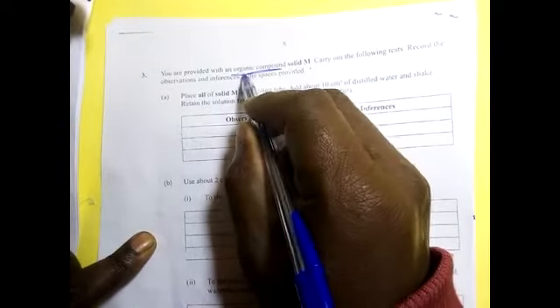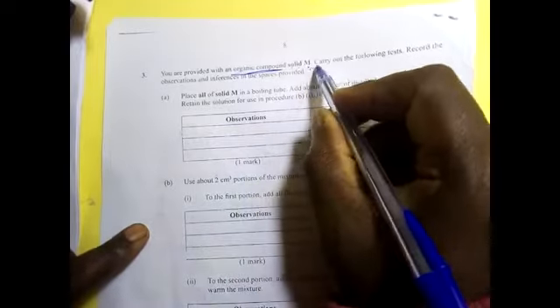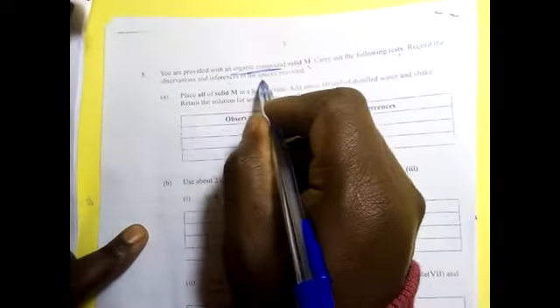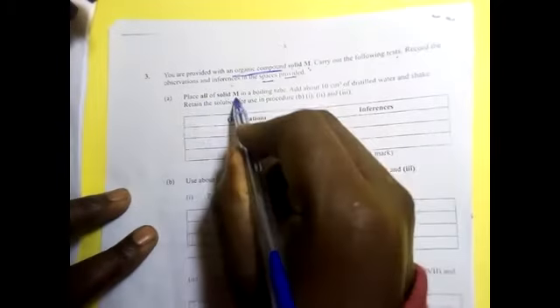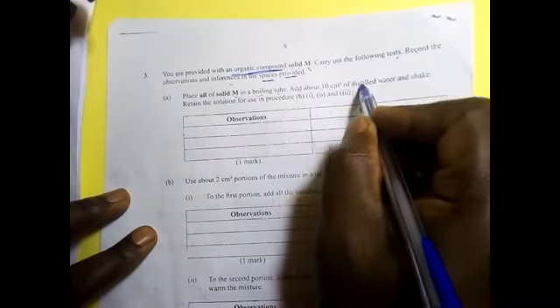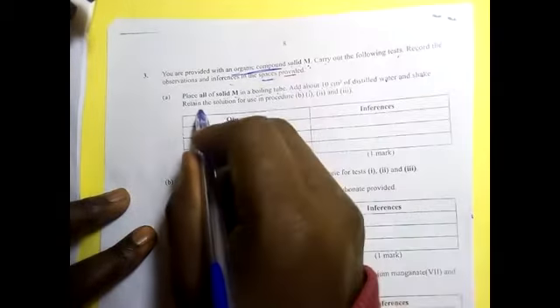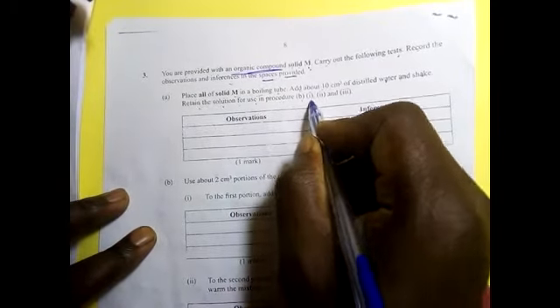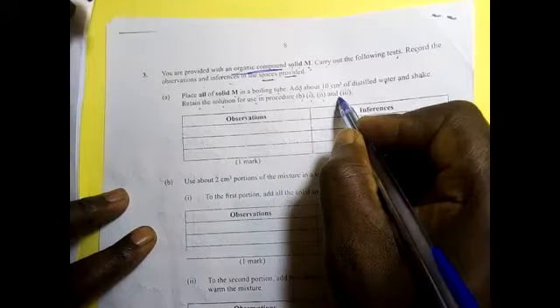Carry out the following test. Record the observations and inferences in the spaces provided. Place all the solid M in a boiling tube. Add about 10 centimeters cube of distilled water and shake. Retain the solution for use in procedure B, Roman 1, Roman 2, and Roman 3.